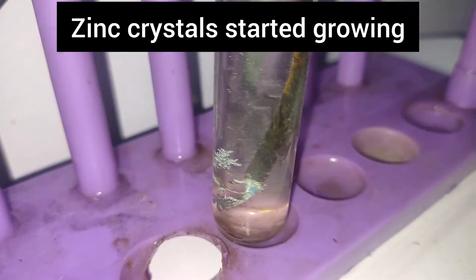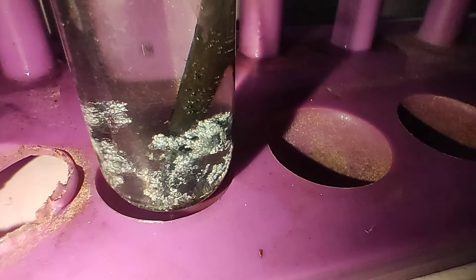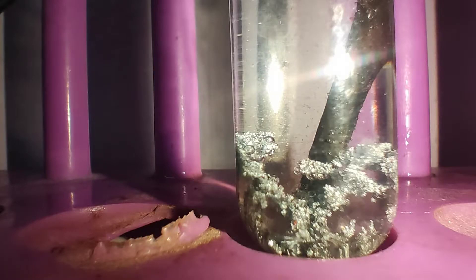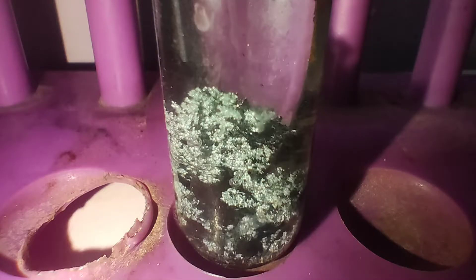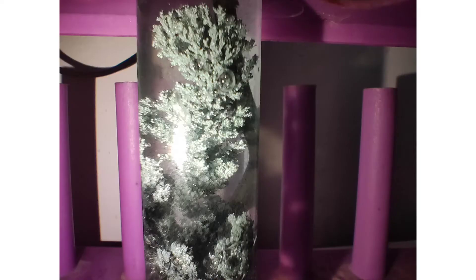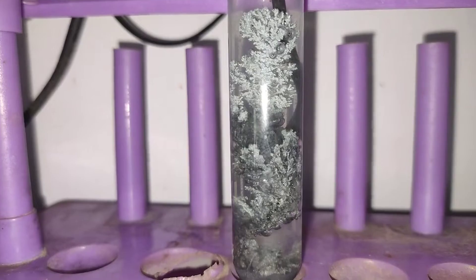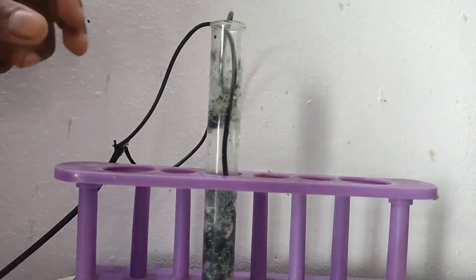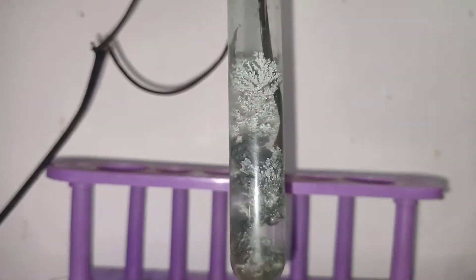After just a few minutes the crystals started growing. I took photos after few intervals of time to show the course of crystal growth. Within one to two hours I got these many crystals. You can see the crystals look pretty nice.